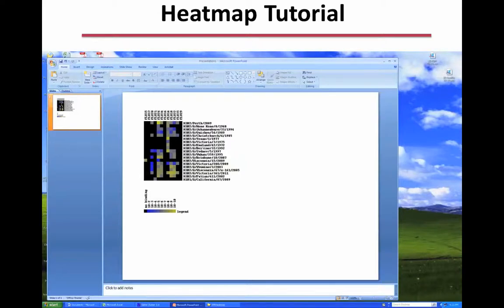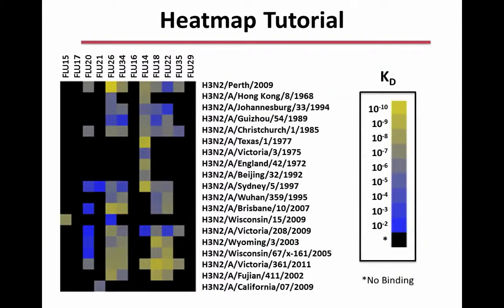And because this uses sort of a rudimentary font and everything for display, I like to go ahead and improve the appearance manually so that it looks a little nicer, although you certainly don't need to do that.